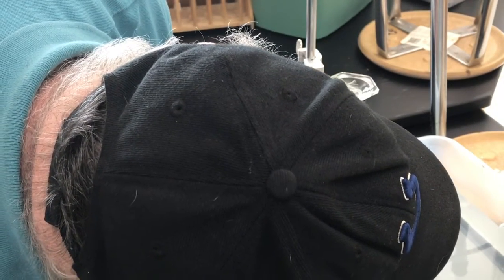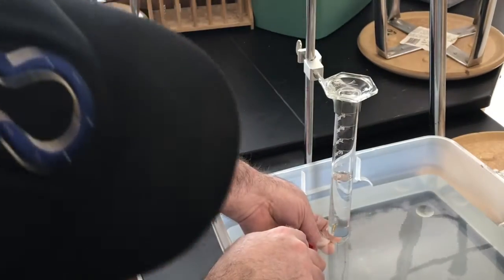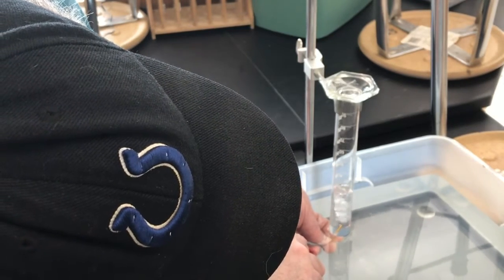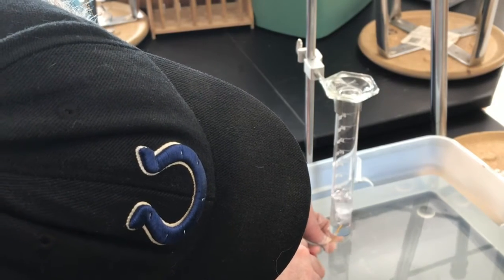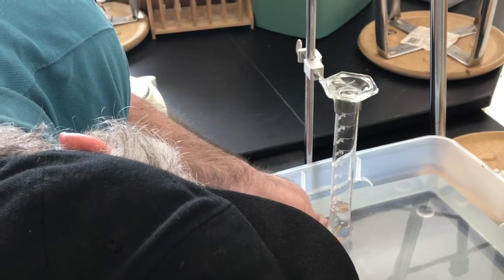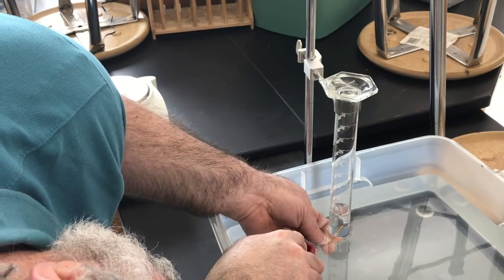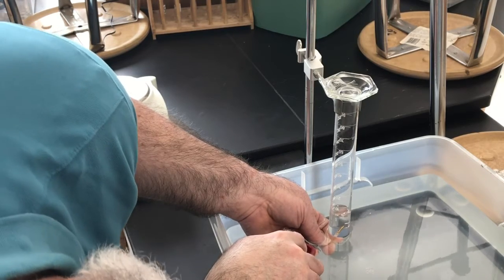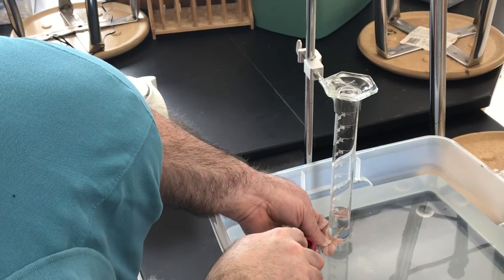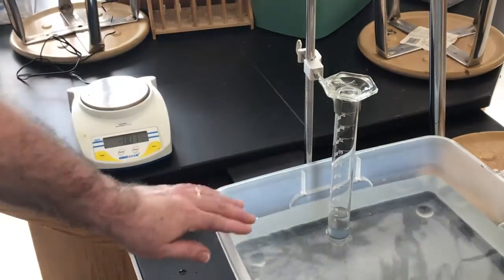I'm going to try to collect right at 100 milliliters. Whoa. I'm getting close. Very close. Okay, that looks to me to be 100 milliliters.